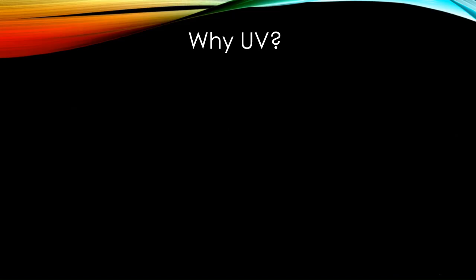However, I think it's important to take into consideration the ultimate goal of this study, which was to provide a method of analysis for small medicinal plant dispensaries and manufacturers in European regions that don't have access to an incredibly expensive piece of equipment like HPLC. So in that sense, affordability would be a real reason why. A cheap nano drop system or UV system could be $16,000 as opposed to hundreds of thousands of dollars for an HPLC.